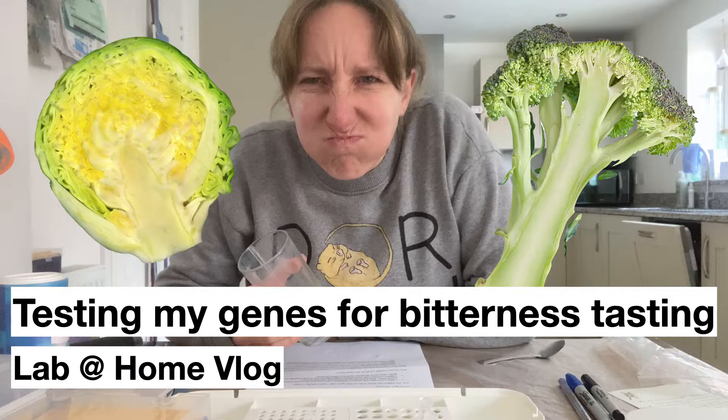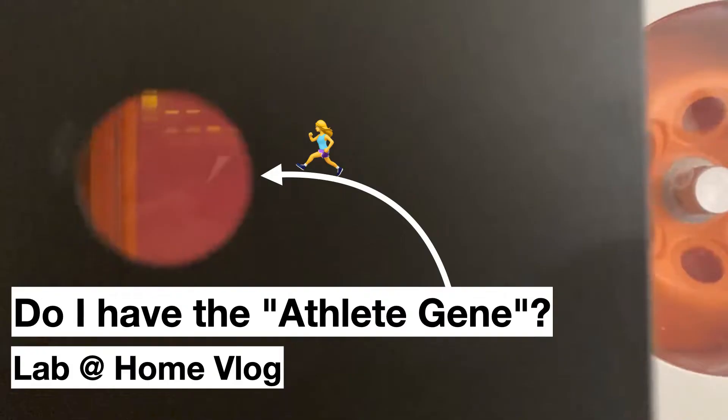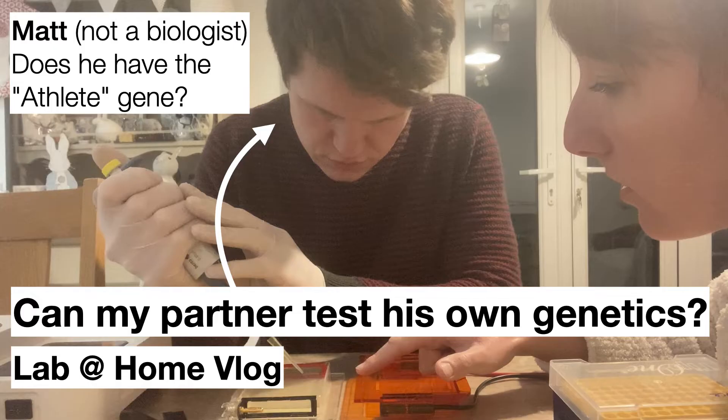I used my own DNA to try out a few of the experiments available in our B101 learning kit. Firstly I tested whether I had a taste receptor that allows me to taste bitterness in foods such as raw broccoli and Brussels sprouts, and then I tested whether I had the athlete gene — spoiler alert, no I don't sadly. I then handed over my Lab at Home setup to my husband for him to extract his own DNA and see if he had the athlete gene, and he found that he is indeed genetically more athletic than I am.